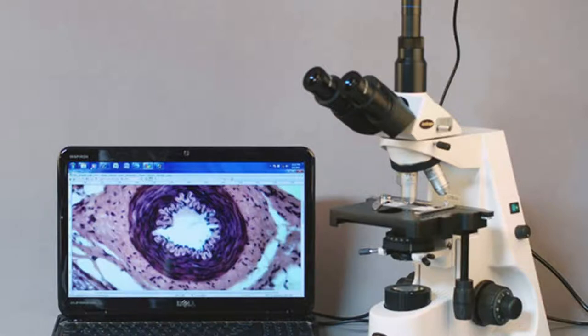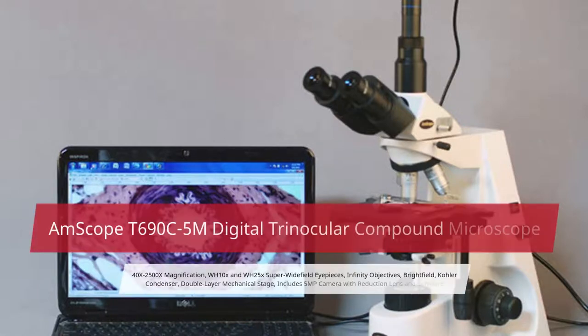AmScope T690C 5M Digital Trinocular Compound Microscope, 40x to 2500X magnification, WH-10X and WH-25X Super Wide-Field Eyepieces, Infinity Objectives, Brightfield, Kohler Condenser, Double Layer Mechanical Stage. Includes 5MP Camera with Reduction Lens and Software.